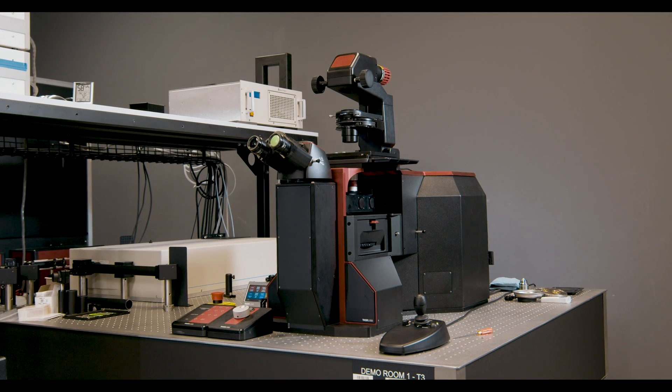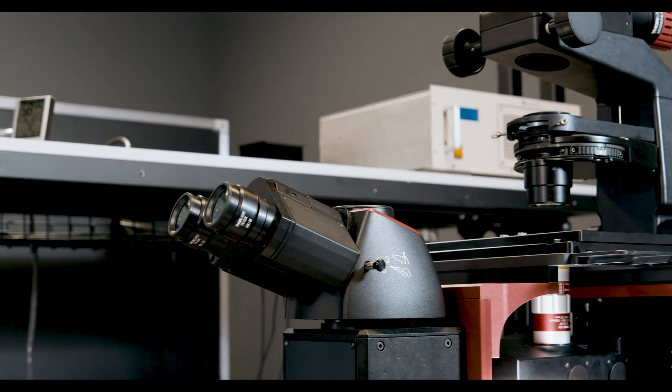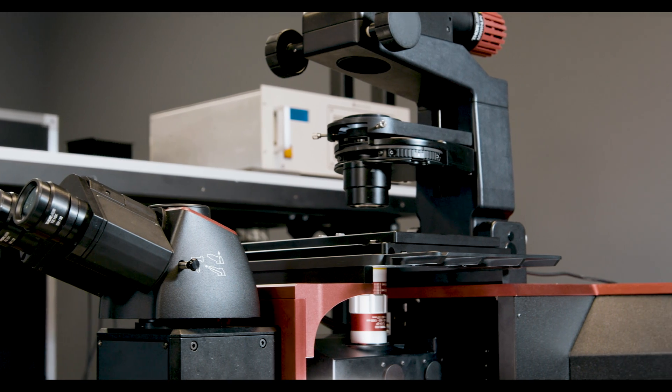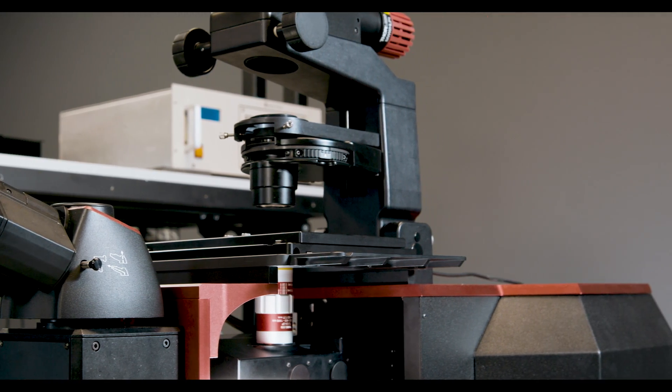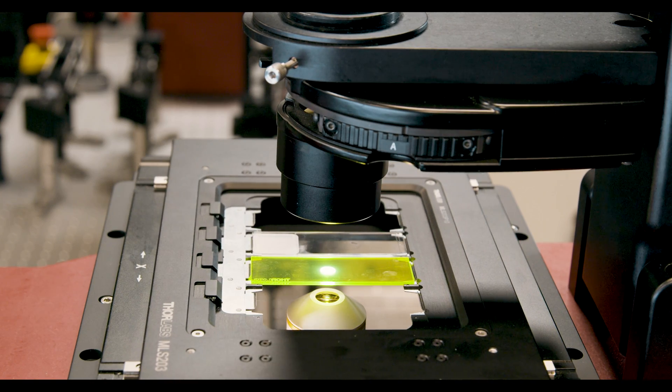The Veneto is an inverted microscope. The idea behind this is that we wanted a versatile microscope that can be used for various imaging and research purposes. One of the things we started out with in terms of designing this particular microscope is we didn't want to compromise on specs just because we wanted it to be versatile and flexible.